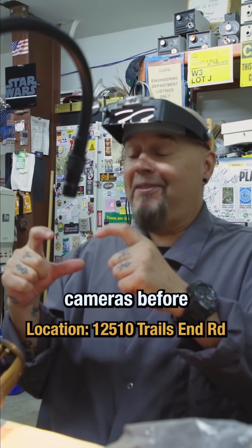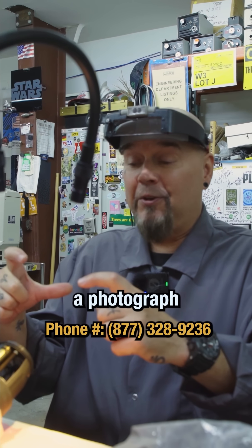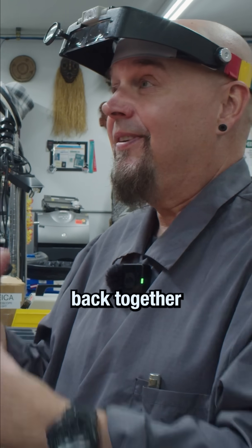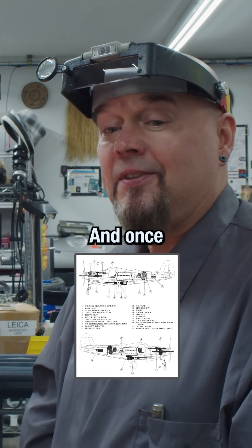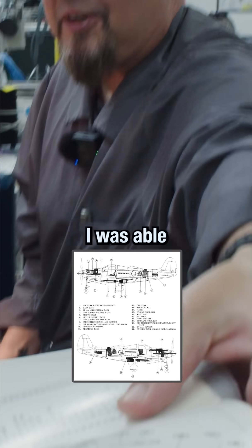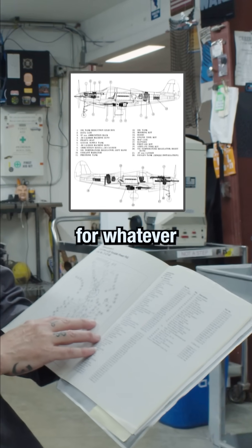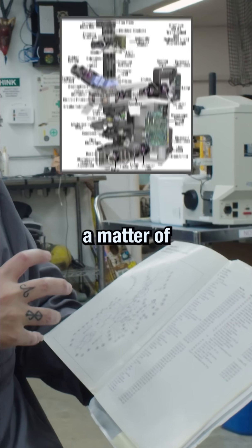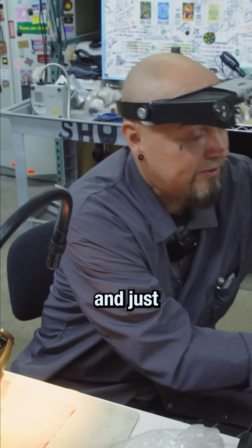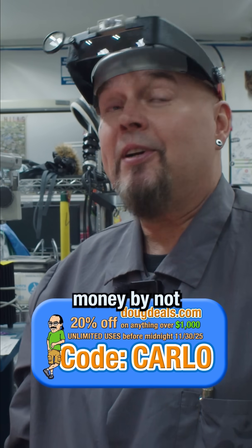Back then we had little digital cameras before our phones all had cameras. I would just take each piece apart, take a photograph, take another piece apart, take another photograph, so I knew how to put it back together. I was in the military, so I learned how to read aviation schematics. And once you know how to read a schematic, I was able to eventually find online the schematics for whatever microscope I was working on. Each part was labeled, so it was just a matter of tinkering and being curious. Mainly it was just self-taught — saved myself a lot of money by not going to school.